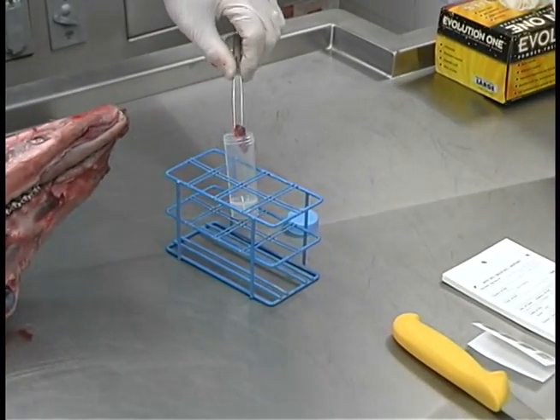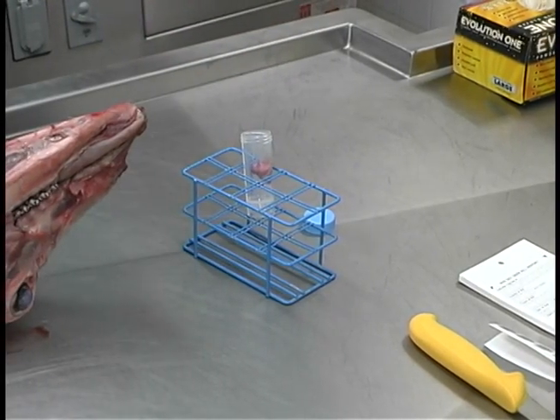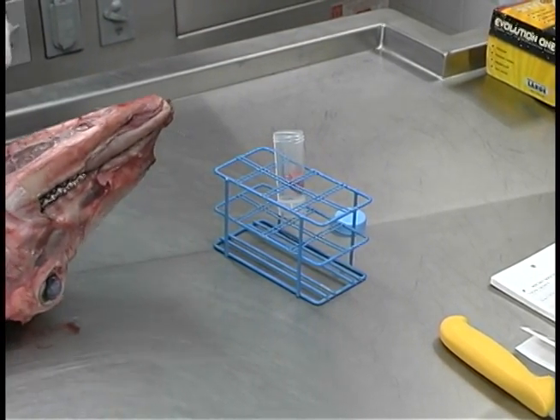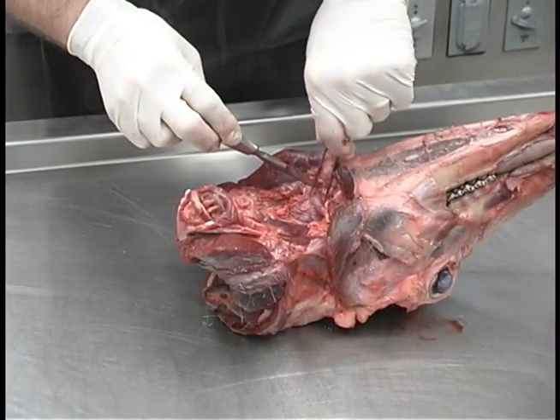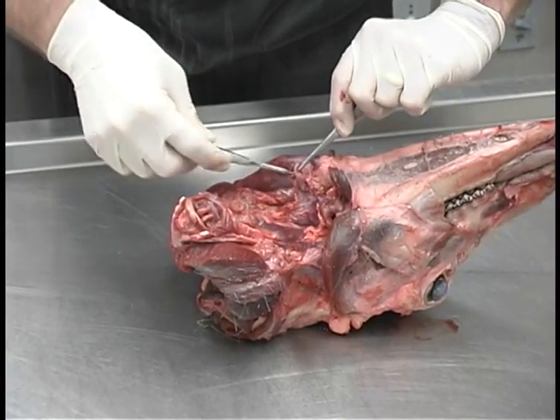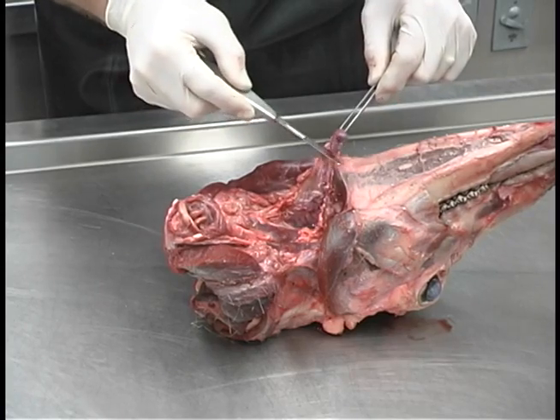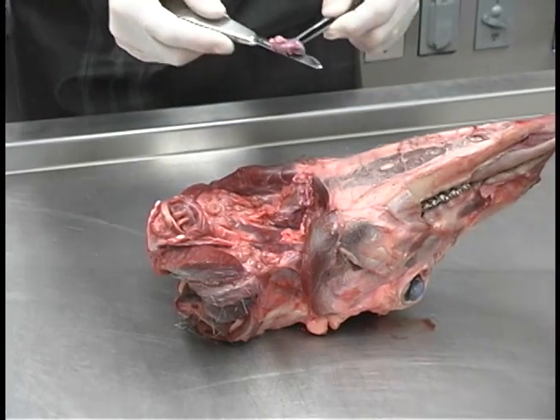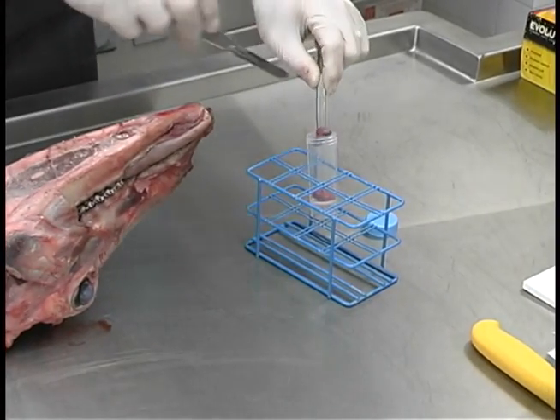Next we place it in the sample tube, being careful not to contaminate the outside of the tube. We do the same thing for the remaining lymph node — we can see it right here. Pull it forward and just cut around it. Place that in the sample tube as well.